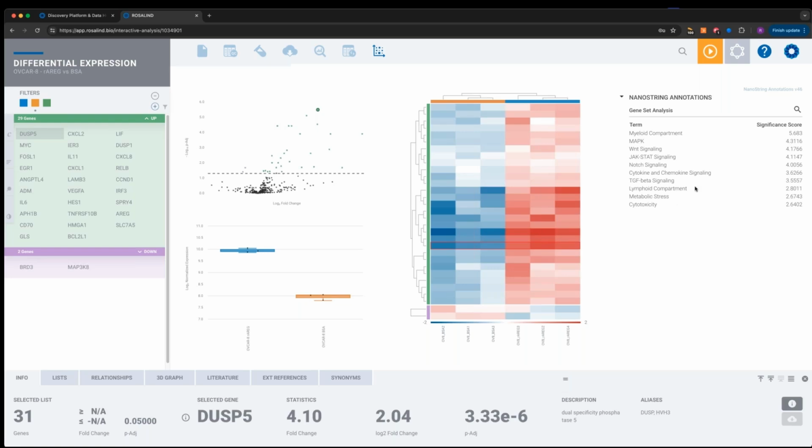We know that there's no p-values associated with these pathways. We know that these are simply scores trying to summarize how much change there is in each pathway, or how much fold change there is in each pathway, conceptually, so to speak. The way that you interpret these is simply a rank order of pathways. So myeloid compartment at the top with a score of 5.68, there's more evidence that this has more fold change in it, more change in it relative to cytotoxicity, which is on the bottom. So when you come to these NanoString GSA scores, it's simply a rank ordering. These are all relative to each other. How much change is there in a particular pathway?